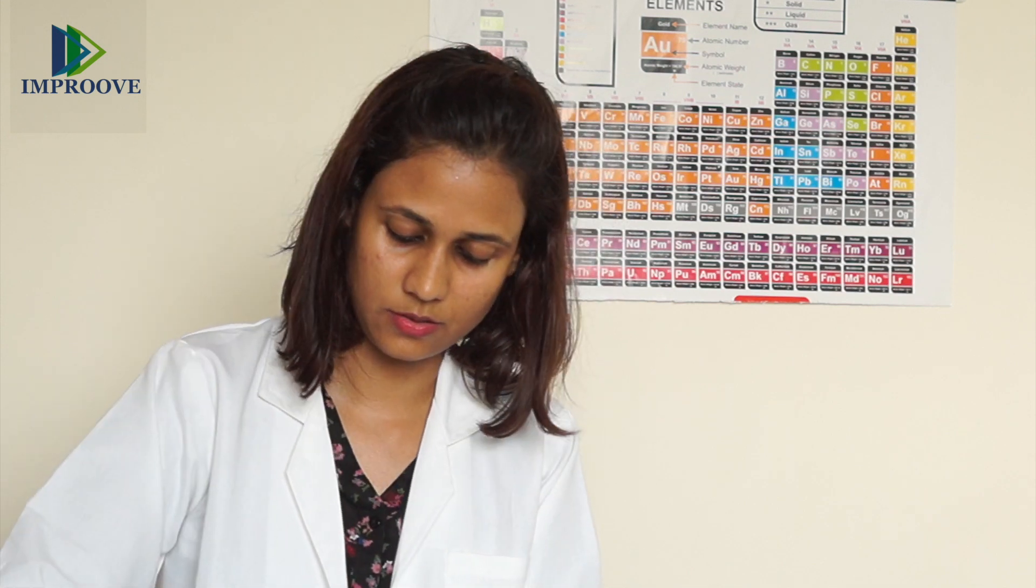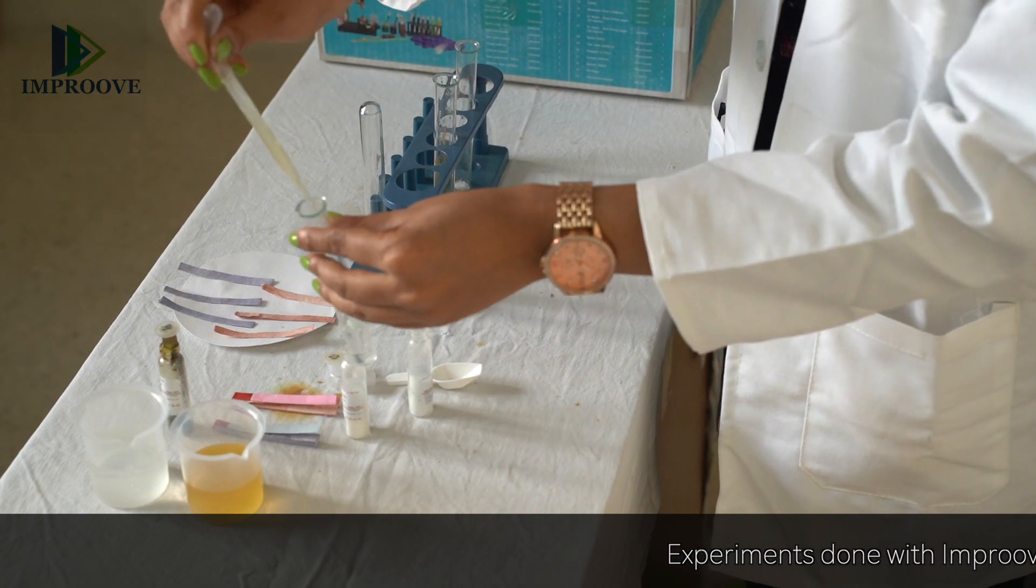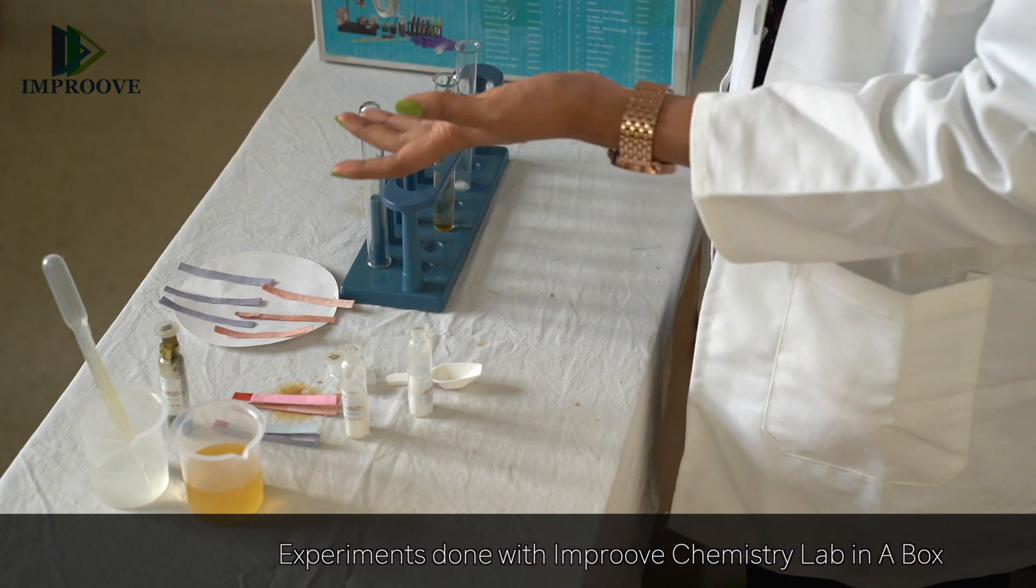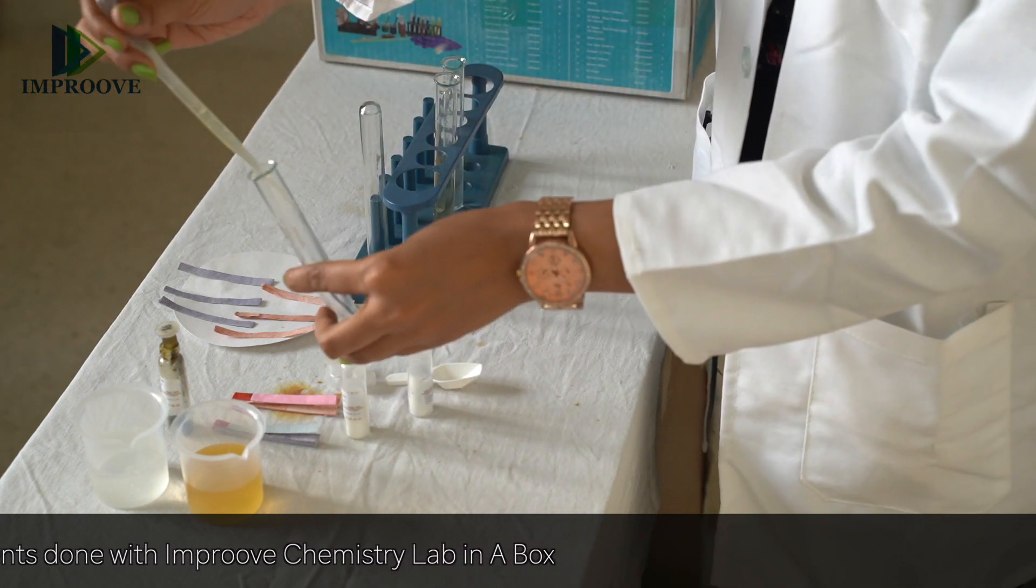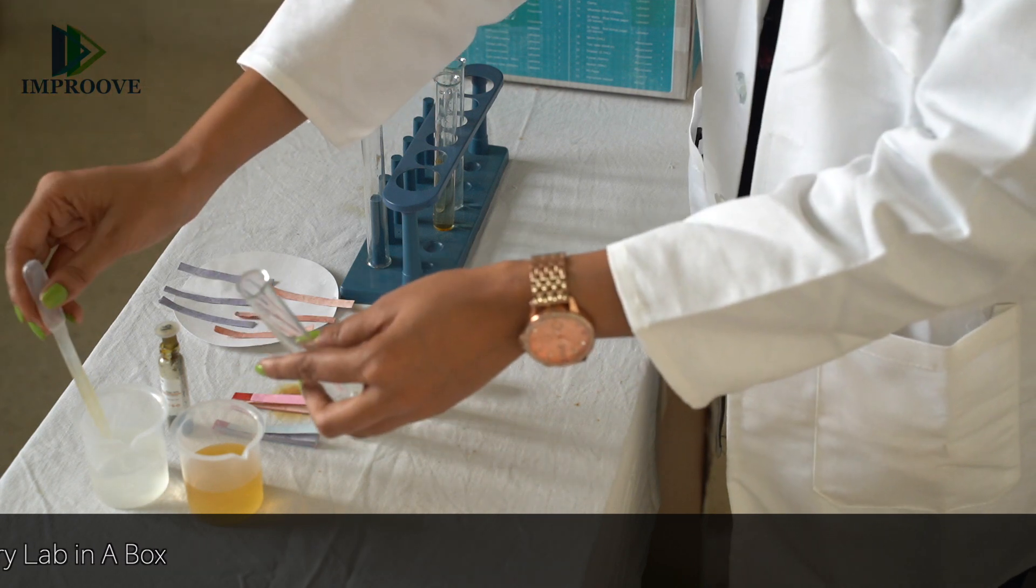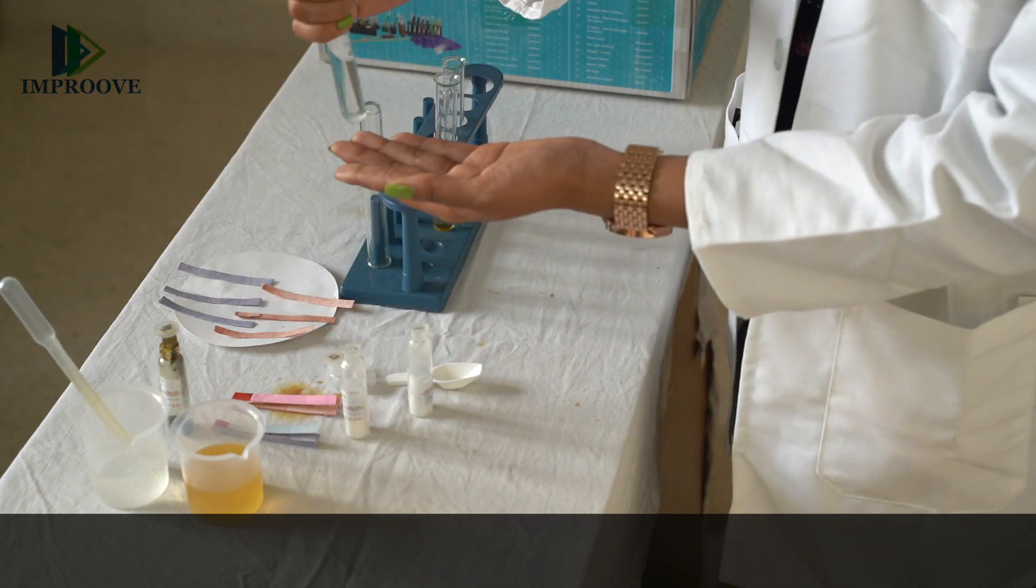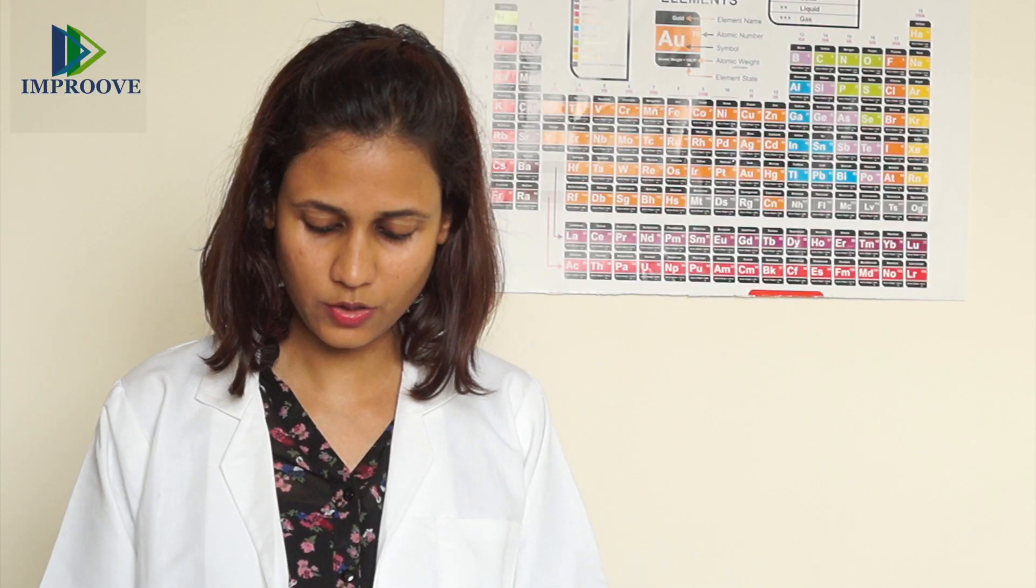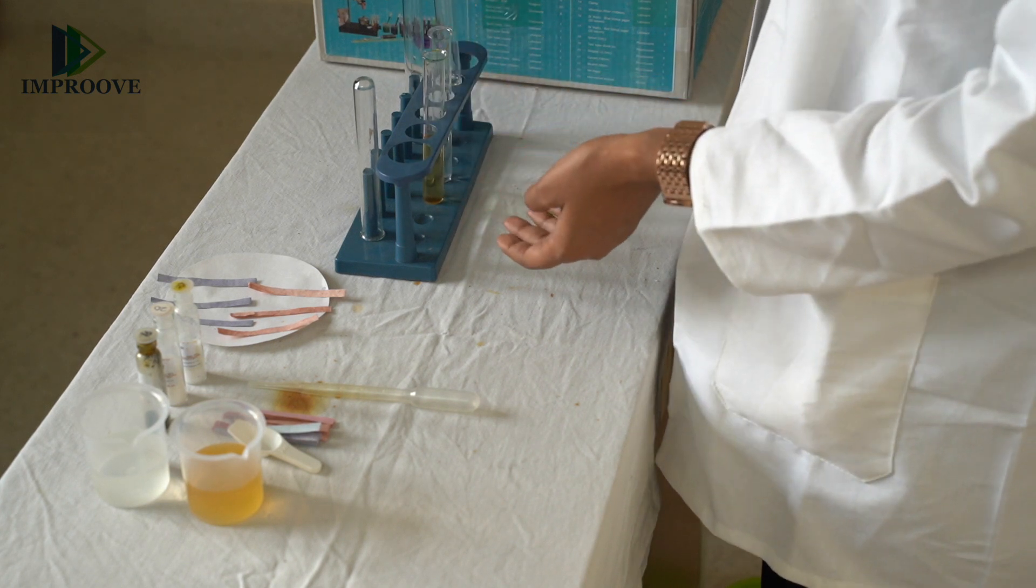Keep adding 10 ml water to the test tube. Now our solutions of the three salts are ready: this is the ferric chloride solution, this is the sodium acetate solution, and this is the sodium chloride solution.